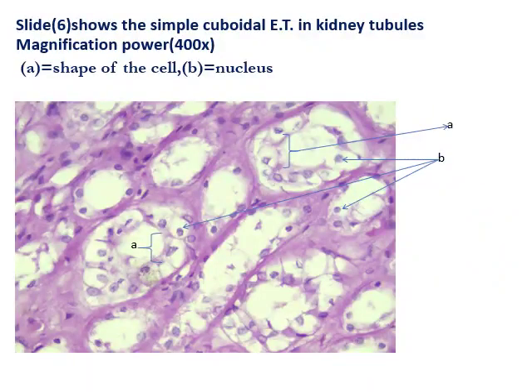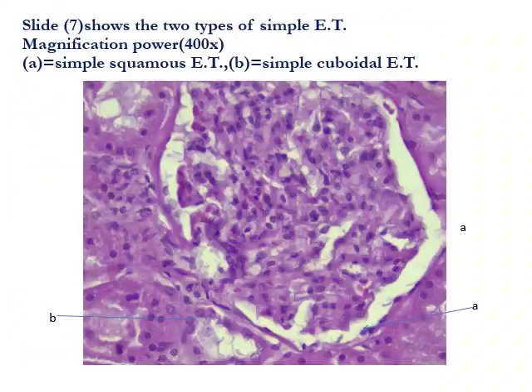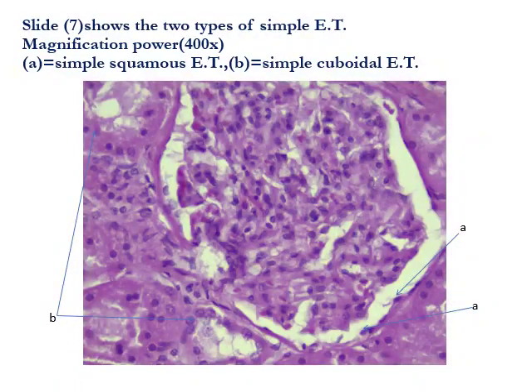This slide shows the simple cuboidal epithelial tissue in the kidney tubules, where A refers to the shape of the cell while B refers to the nucleus of the cuboidal cell. This slide also shows the two types of simple epithelial tissue in the kidney: A refers to the simple squamous epithelial tissue in Bowman's capsule, while B refers to the simple cuboidal epithelial tissue in the kidney tubules.